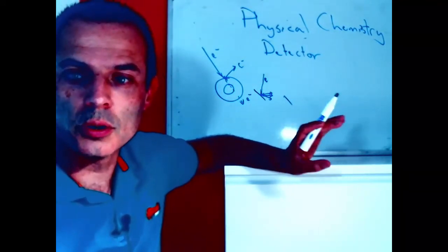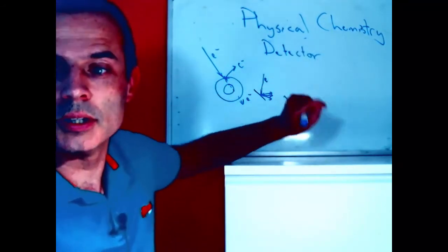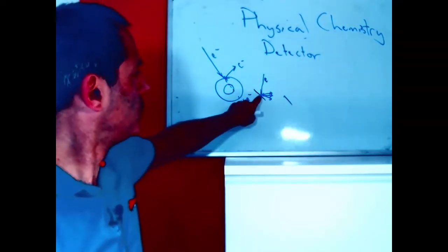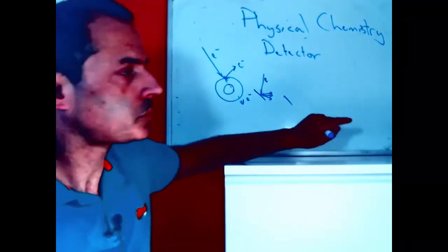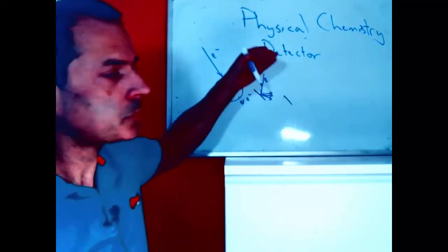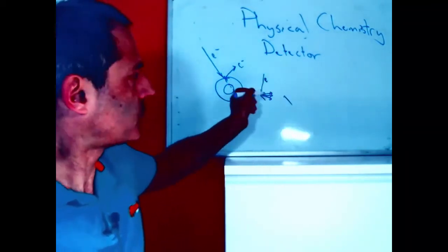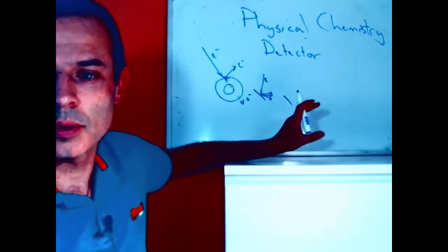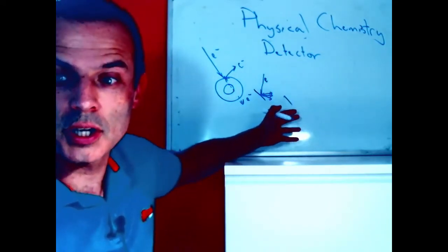Typically they'll be coated with gold because it has a high secondary electron coefficient, so the number of electrons that come off is quite high, and the gold will be attached to a power supply to give it the electrons back so that it's ready to receive the next electron. It also allows us to control the voltage on all of these so that they're staged, so that each one gives electrons to the next one. Typically they're curved, so it behaves like an optical system. They focus and it goes eventually to a collector that measures the current.